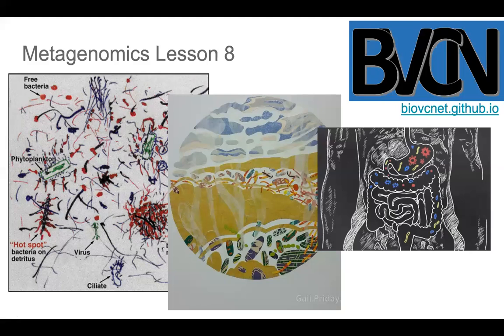It's lesson 8, even though it is the 6th lesson that we'll be putting out, because between the previous one on metagenome assembly and this lesson, there will still be lessons on assembly metrics to check how good your assembly was, and assembly visualization, so looking at your assembly graph. And then binning is something you would do with your assembled contigs. So lesson 8 of metagenomics covers binning.